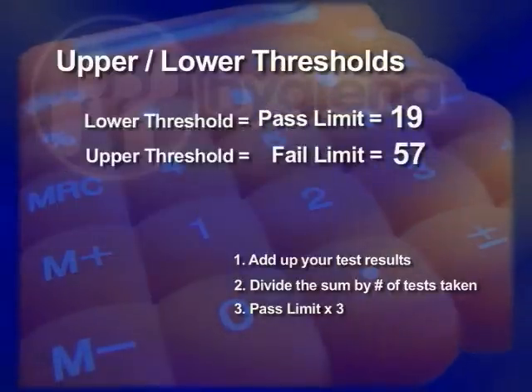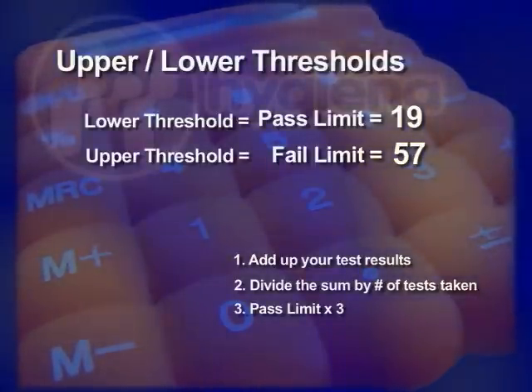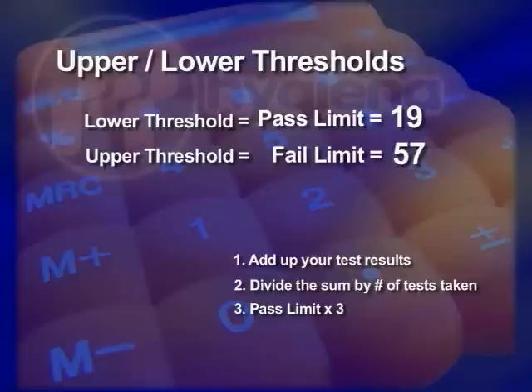These are your thresholds. You can now enter them into your SystemSure Plus program and synchronize to your device, or enter them directly into your luminometer under the threshold category. Any test number falling in between these two numbers should be considered as a caution zone.